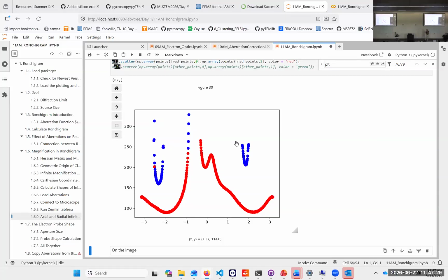What you can do is, in anything that is a diffraction pattern, you go to polar coordinates, angle over distance, right? And if you look at angle over distance, then it looks much, much clearer. So you have the radial ones here, and here the axial ones. And here you have a weird mixture of them too, so you cannot discriminate them. The trick, however, is something you always should do when you do a diffraction pattern.